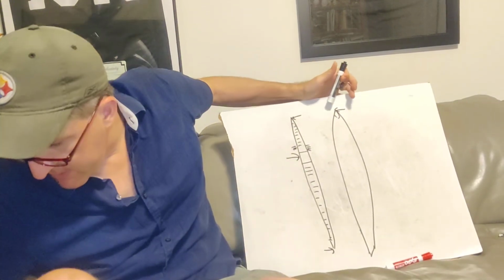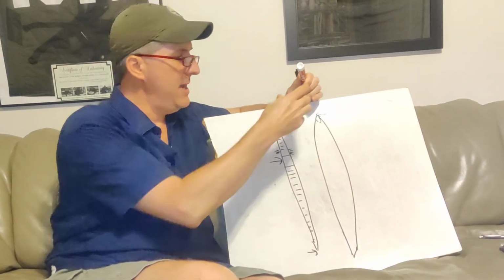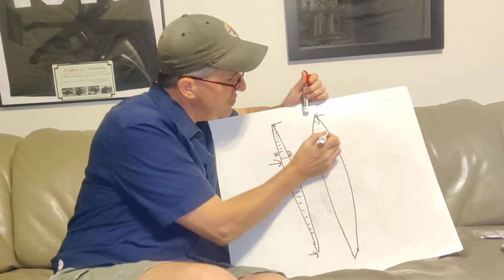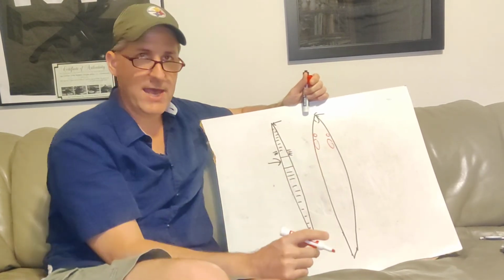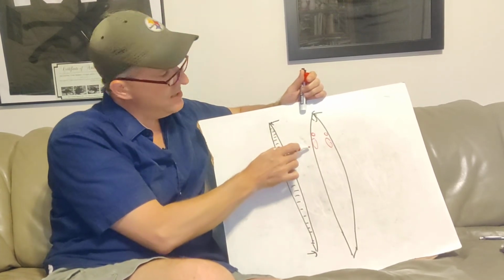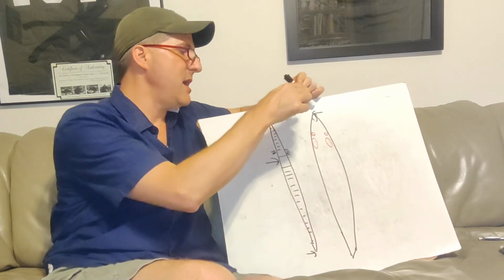The landmarks that occur in an earthworm are white. Those are the gonads, okay? So roughly right about here, there would be two little white bodies, one on the left, one on the right, and then right behind it, two large white bodies right behind that. Those are the gonads. The ones that are more anterior are testes. The ones that are more toward the back side, posterior, are going to be the ovaries. Again, male and female at the same time.